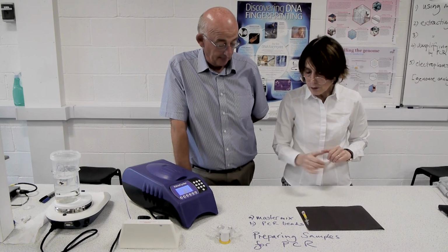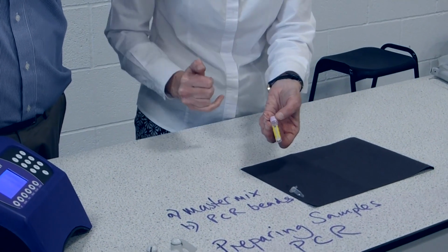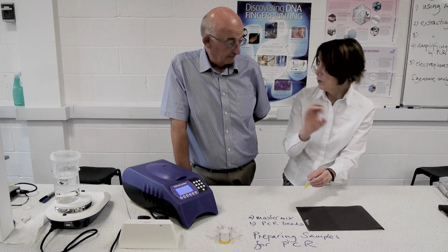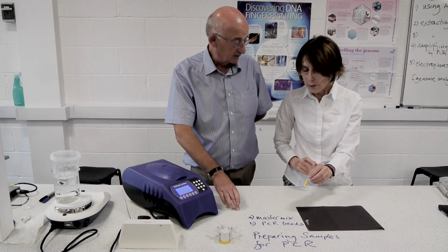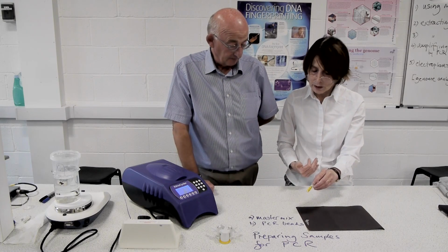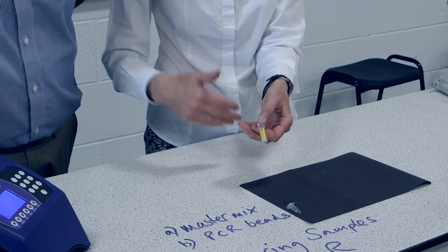For master mix, you have a tube this size, and it contains enough master mix for 32 samples. What you do when you get it in is you aliquot it out into separate containers, because the last thing we'd want is our students contaminating the whole lot. We'd want to have those student-specific little containers, and some technical work in the background to do that. So you aliquot enough for a class to use, and you may not need to use all of this. What you don't need to use, you put in your freezer, and it'll keep until you need to defrost it.